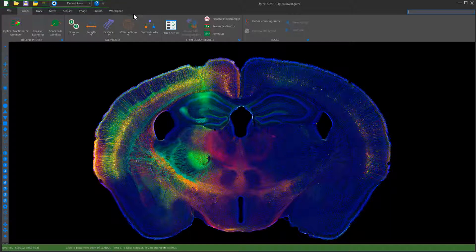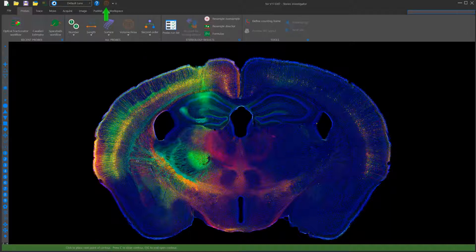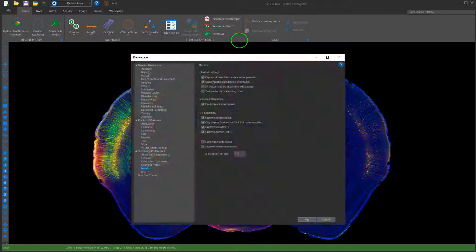Any tool can be added to this toolbar by right-clicking on the icon. You may have noticed a gear icon in the lower right corner of some tool groups. Click this icon to access advanced settings for that particular group.